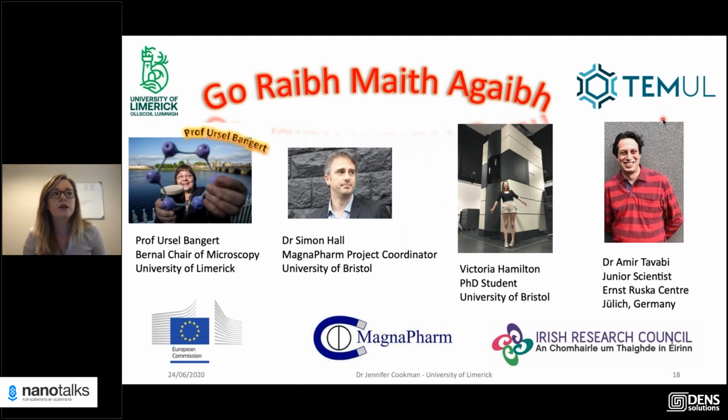I think the Ocean holder is a great system to start out with. It's very simple to use, and it's very ideal for the basic liquid phase experiments, not just the kind of experiments I do where I'm inducing crystallization from a solution, but it's also very easy to drop cast materials and do some sort of reduction experiments with it. With the Ocean, there's not a lot of control on the thickness of the liquid, but the STREAM does have that control with the syringe pump system. I don't know, maybe Annette could say more about that.